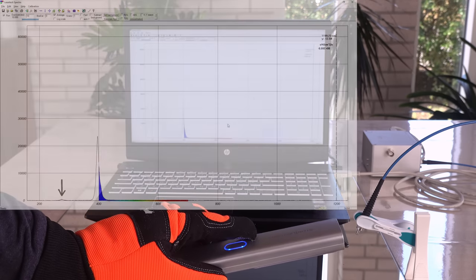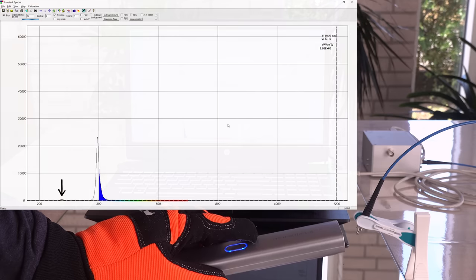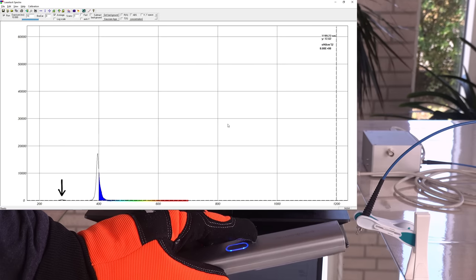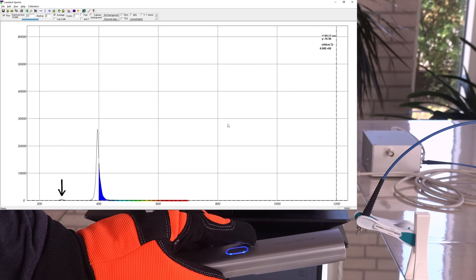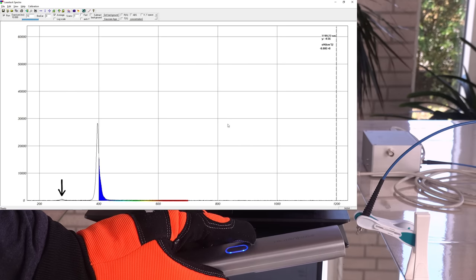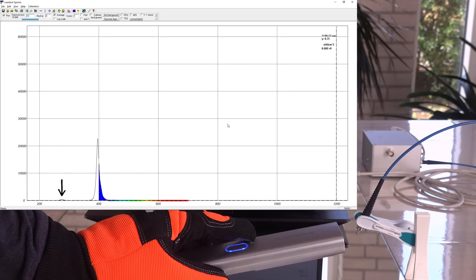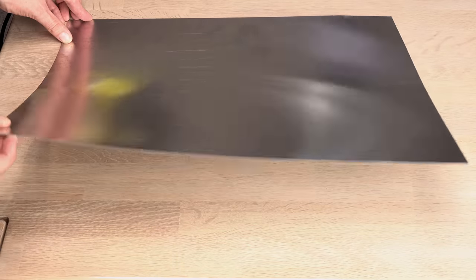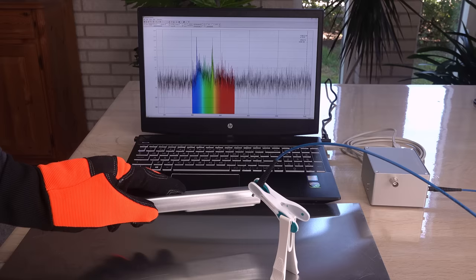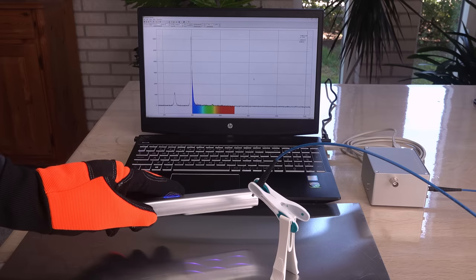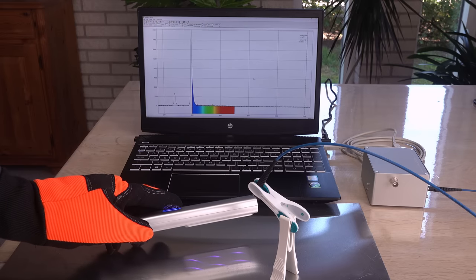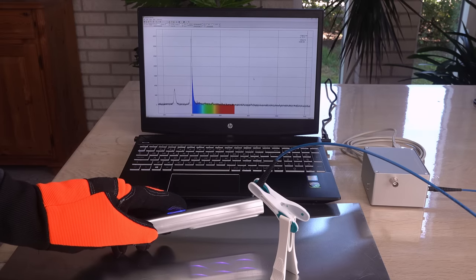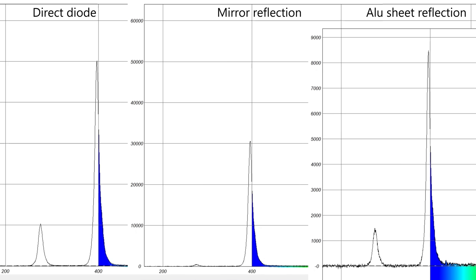Some UVC is reflected, but not nearly as well as the UVA. A less specular aluminum sheet has a reflection that looks almost like the spectrum directly from the diode. The mirror seems to absorb the UVC. Can you guess why? More info later.